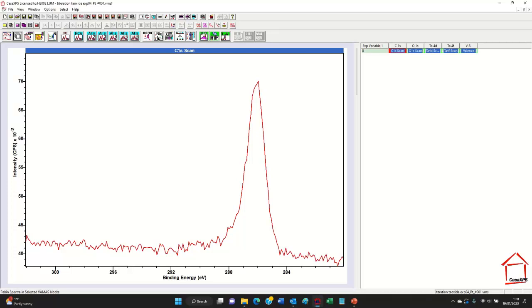This would also have been available on the calculator property page. There's a button that was previously just on the Sims toolbar, and ways of copying data from one set of spectra, forming a new file containing the merged data, and so on. So all of these toolbar buttons are designed to support an application.